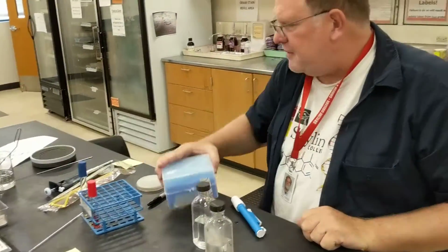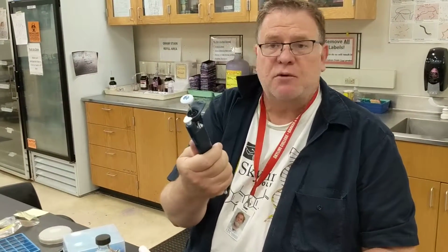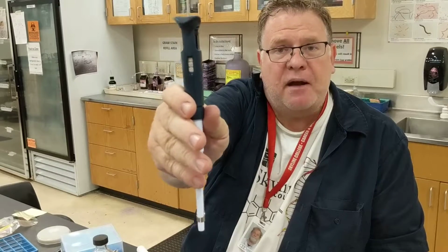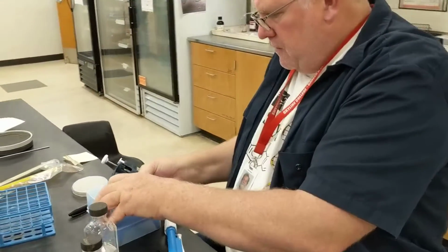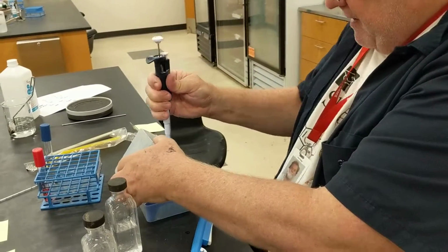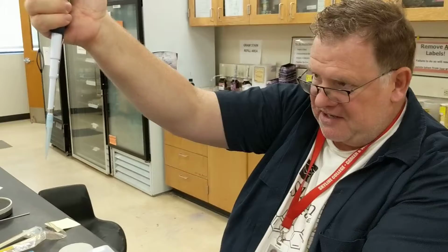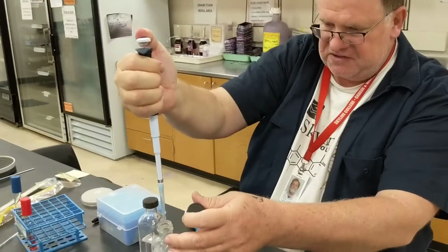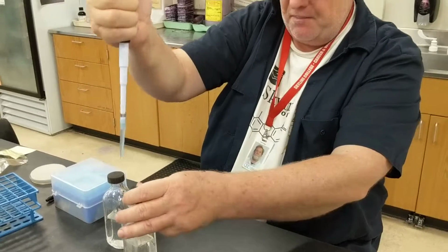Now, I'm going to show you a slightly different technique. We have another piece of equipment that we can use to move 1 ml, and this is called a pipetter. You can take this pipetter and get a sterile pipette tip. It's set to 1 ml. I would press it down until I first feel resistance. Try not to touch the sides. Go in, take out a sample.